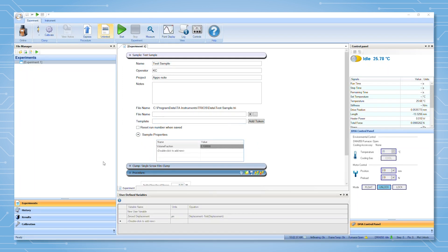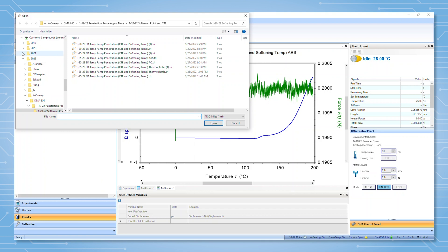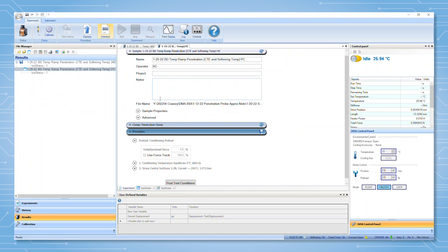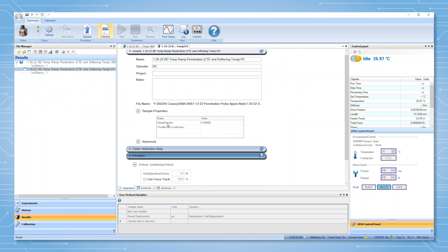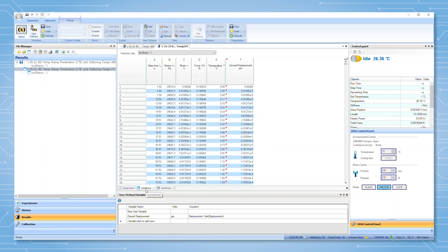Now I will show you how to create a user variable with which the scalar value or any other pre-existing variable can be used for calculating a variable from a user-defined equation. After an experiment is conducted and a results file is obtained, I can open up the results file within TRIOS. After opening up a results file, navigate to the spreadsheet view of the data.